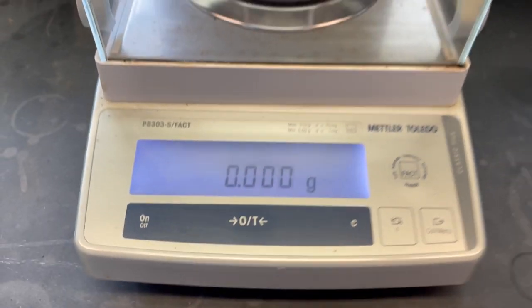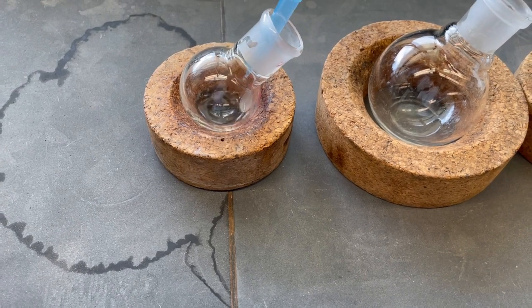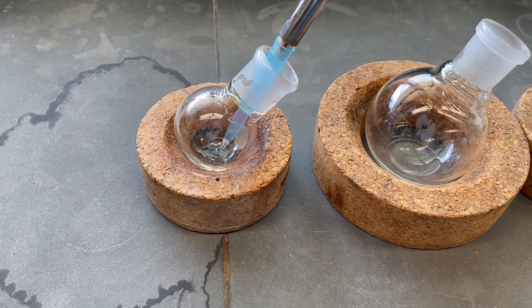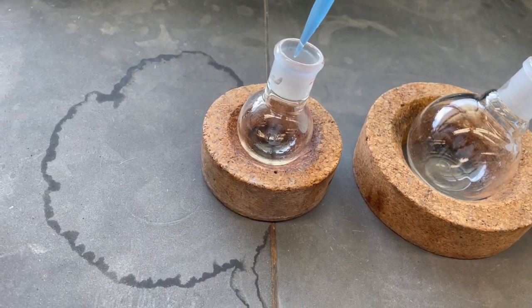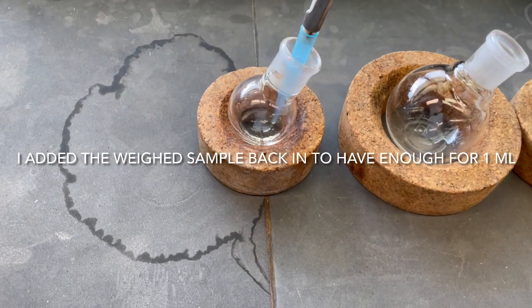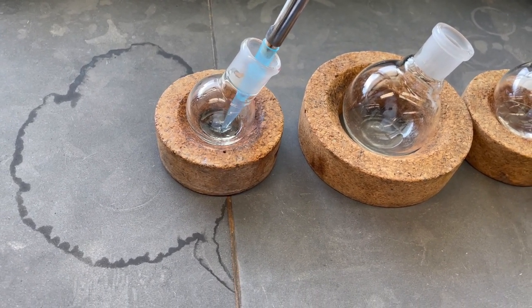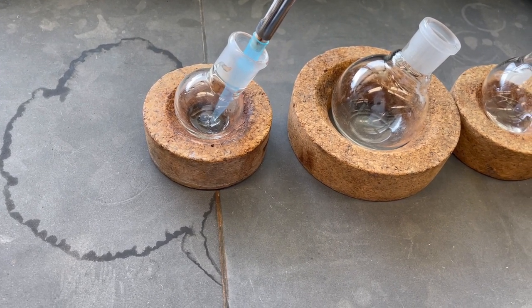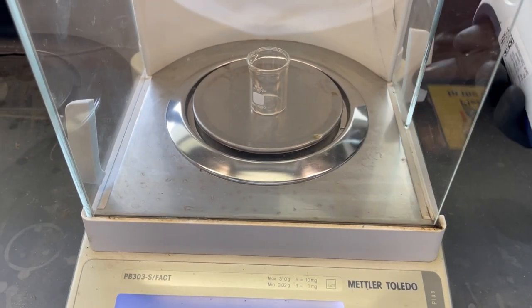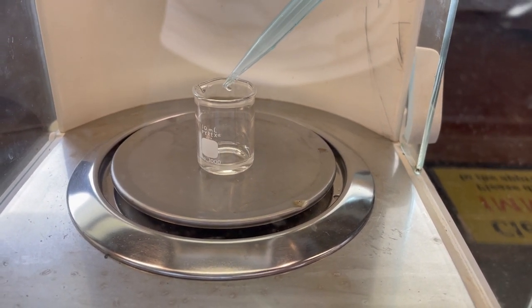You know what I'm gonna do though? I'm gonna go ahead and tare that. See if I've got enough in here. Let's go ahead and get rid of that, and then take some in. Slowly taking in the liquid. Oh, we don't have enough. I took in bubbles. All right, so let's see. Let's take some in, dump it. Transfer to our beaker, and what do you think it is?